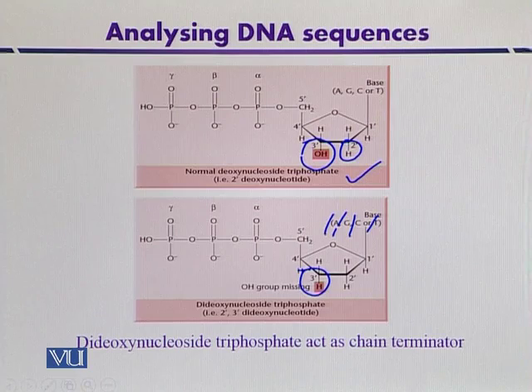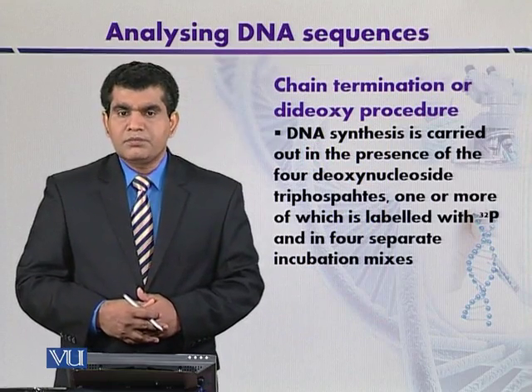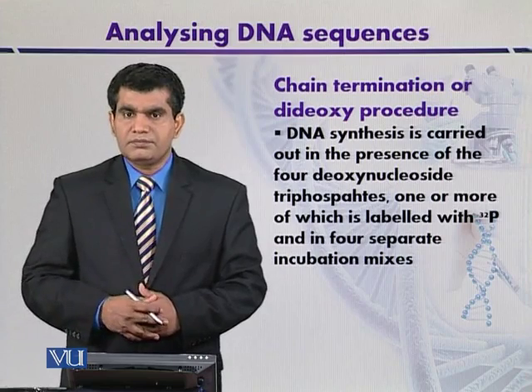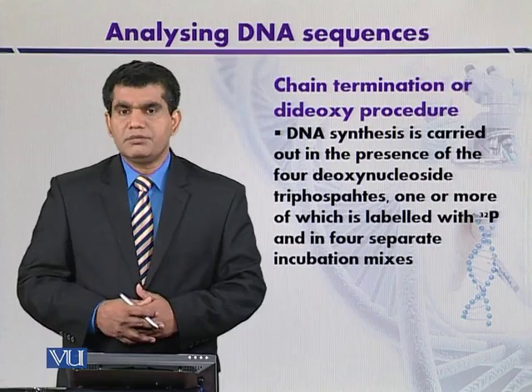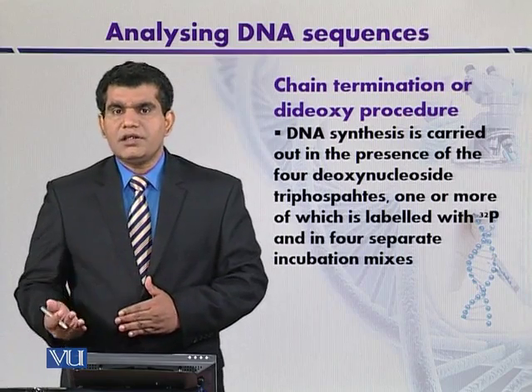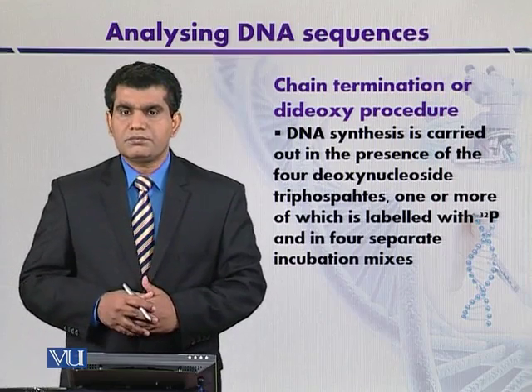after different time intervals. So in the dideoxy procedure or chain termination method, the DNA synthesis is carried out in 4 different reaction mixtures that contain the respective modified nucleotide base, like dideoxynucleoside triphosphate for guanine or adenine, thymine or cytosine. So 4 different reaction mixtures are used.